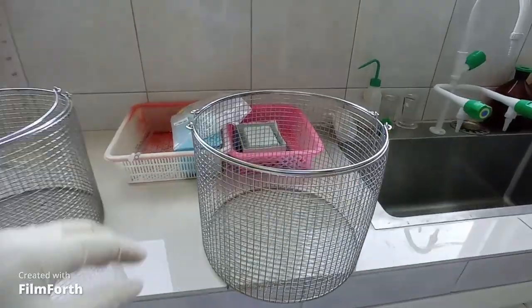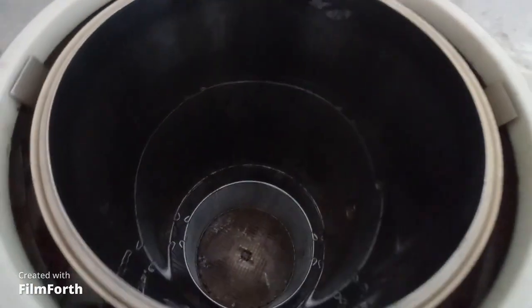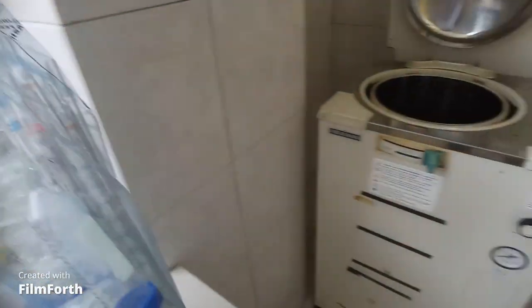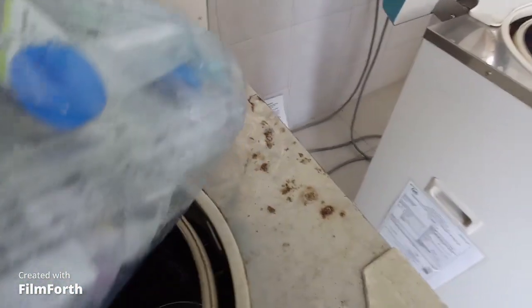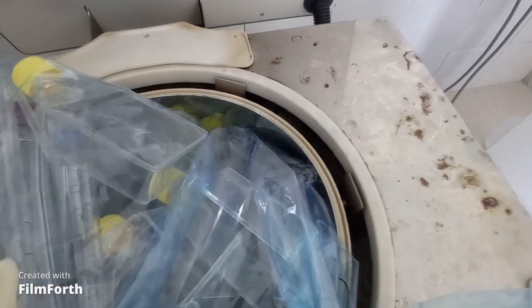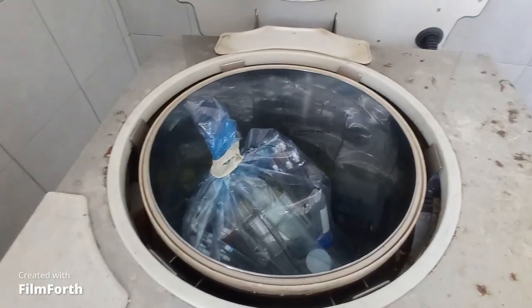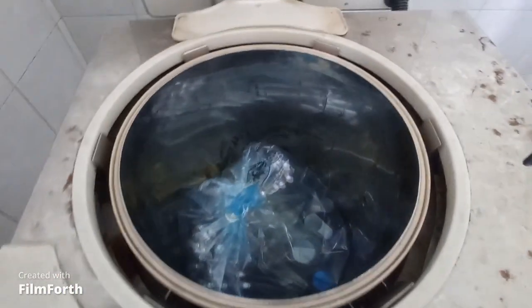I grabbed the bucket and put it inside the machine. Now I will put in the clinical waste that I need to sterilize. It's not fitting into the machine, so I have to make sure I put it accurately inside. After trying several times, I am finally successful in placing the clinical waste correctly inside the machine on the bucket.